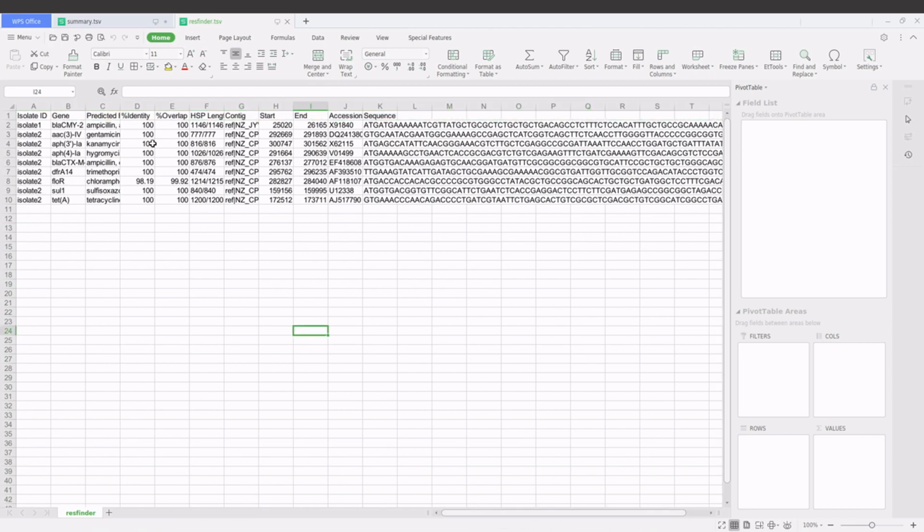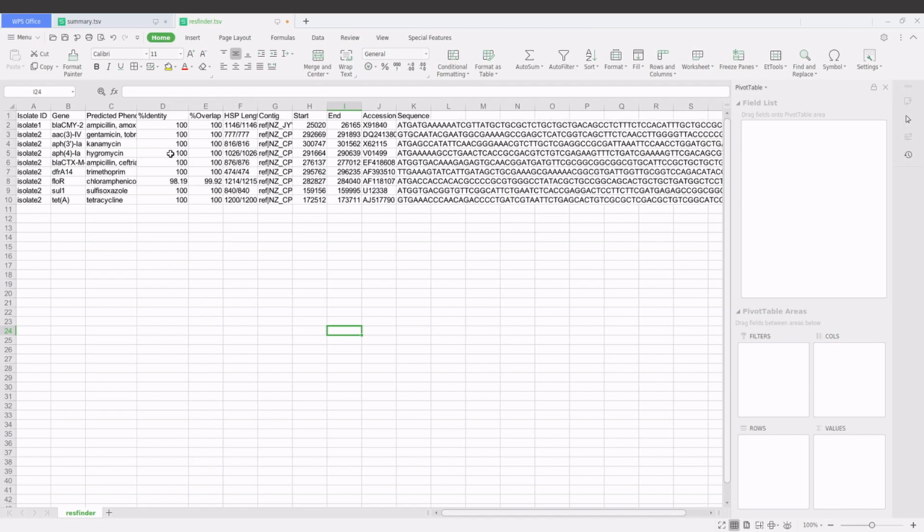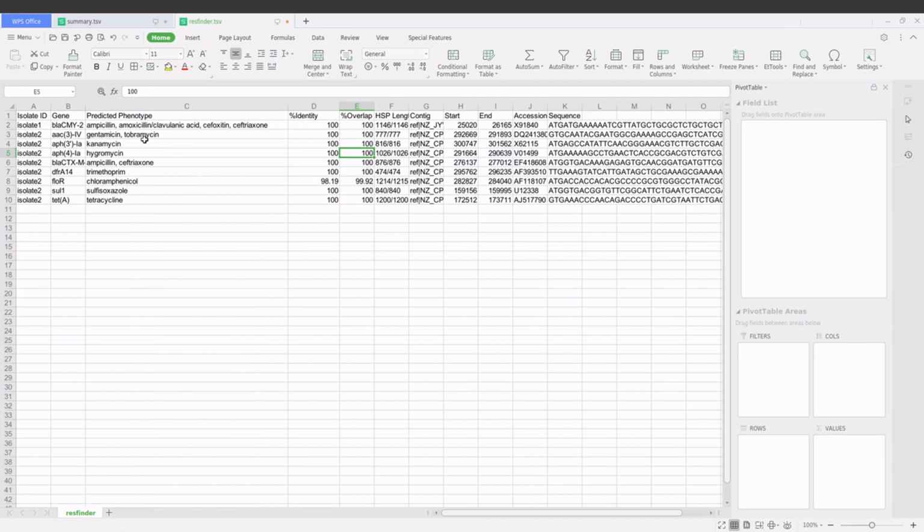We are going to explore some of the columns. The rest I'll leave to you to do. This tutorial is to serve as an intro so that you can take it up from there. So we'll just look at some of them. Let's take a look at the columns here. We will just look at some of them.